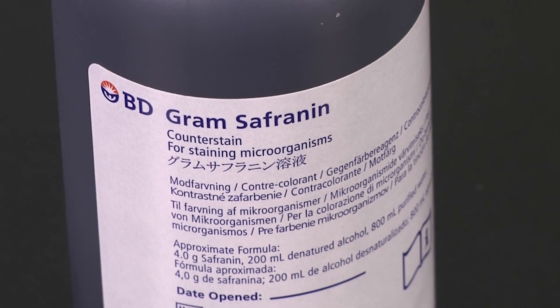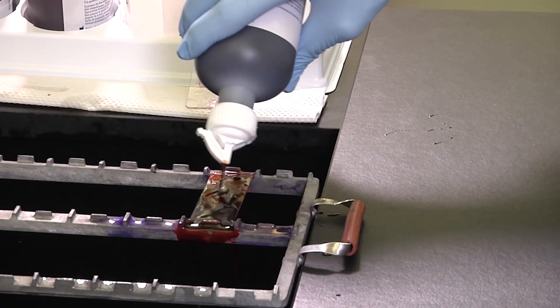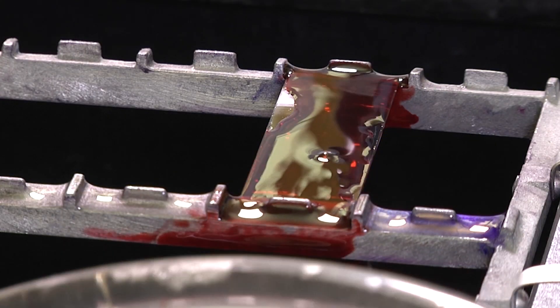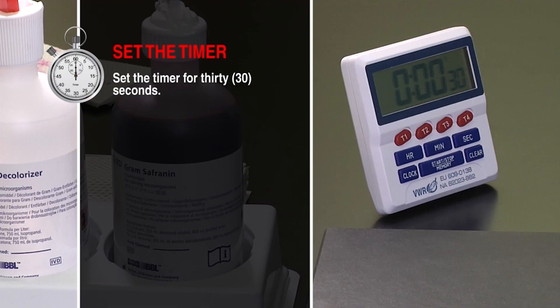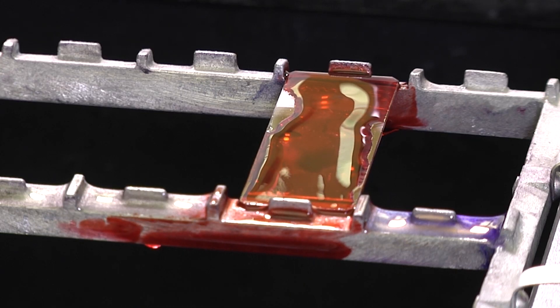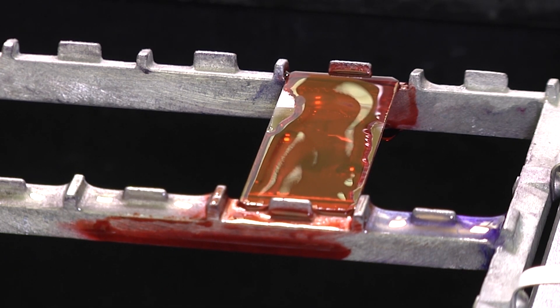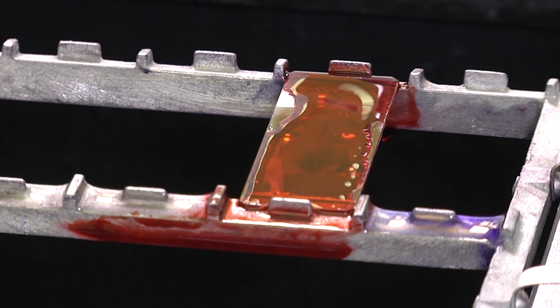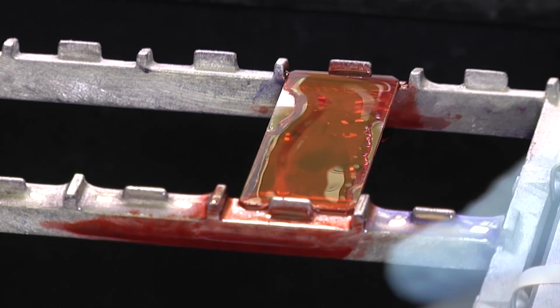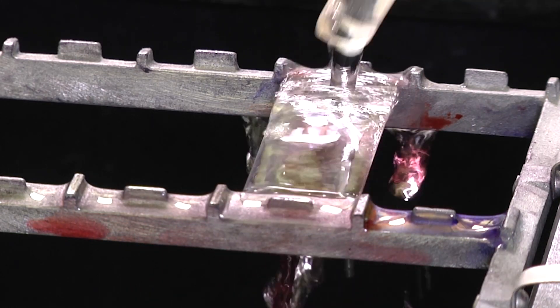Due to the fact that some bacteria are colorless after the decolorizing step, a counterstain such as safranine or carbolfuchsin is then poured over the slide to stain the colorless bacteria. Set the timer for 30 seconds. During this step, the safranine or carbolfuchsin is taken up by the colorless cells and is seen as having a pink color under the microscope. Those bacteria where the crystal violet iodine complex was not leached from the cell during the decolorizing step will remain purple. After 30 seconds, rinse the slide gently with water to remove excess counterstain and allow the slide to air dry.